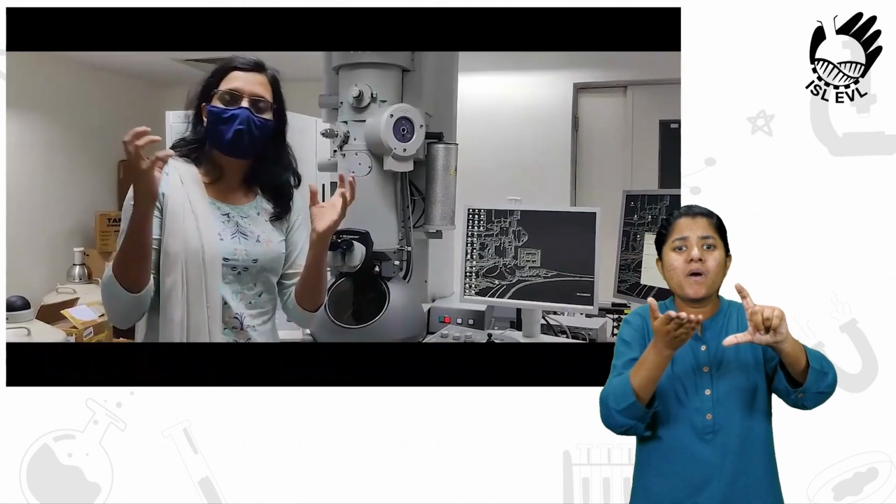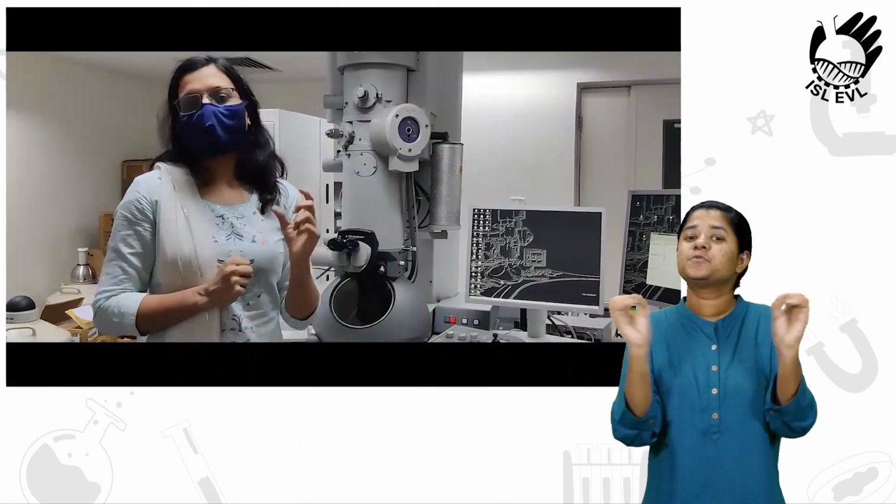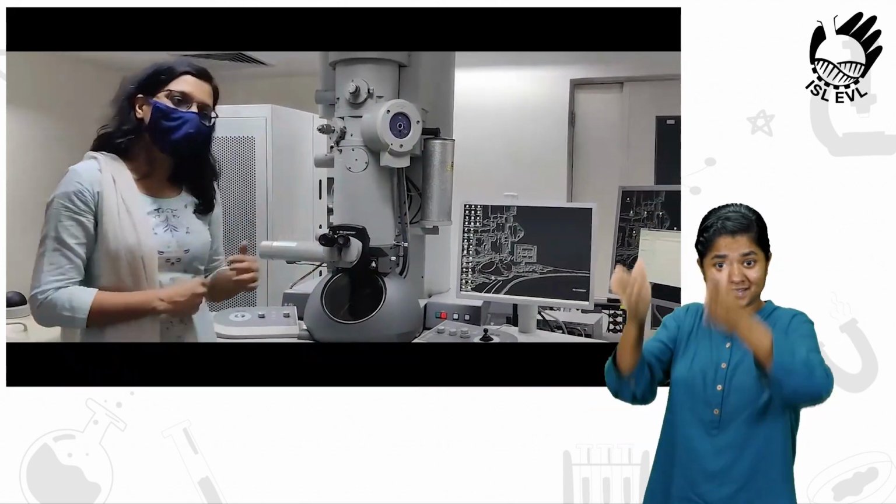In a nutshell, it magnifies a given object while still retaining the clarity. For example, if you look at any of the images that you take in the camera of your phone, when you try to enlarge it or magnify it, what you see is that the picture starts to get pixelated or you lose the clarity. So here it magnifies to a really large extent, but it still does not give you that pixelation or the blurred images. So the clarity is absolutely maintained.